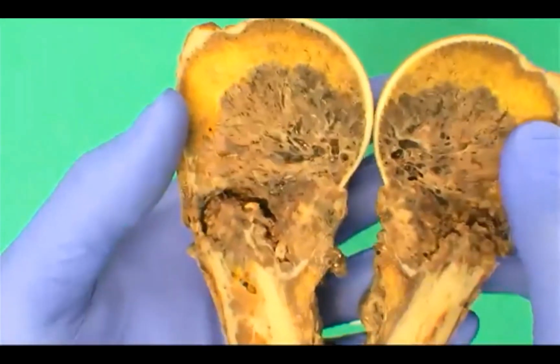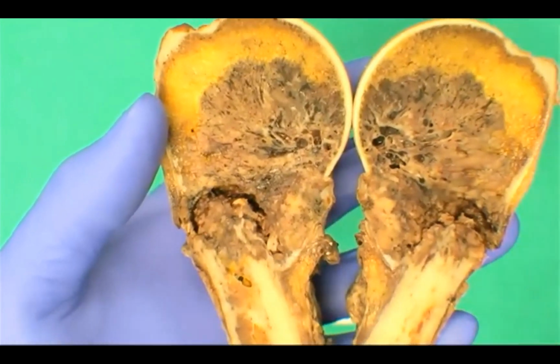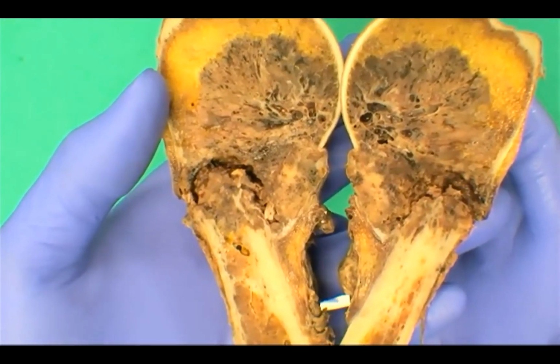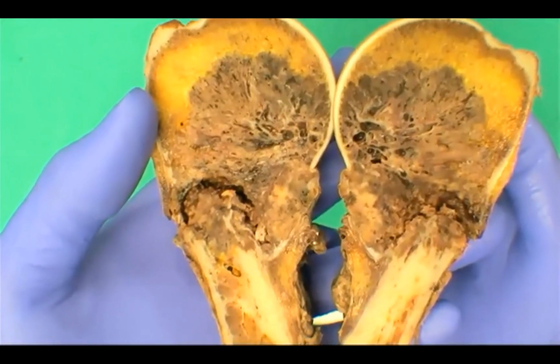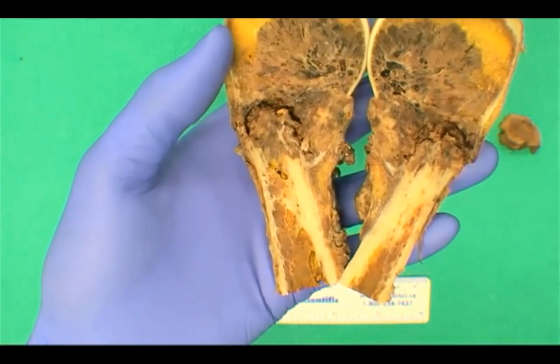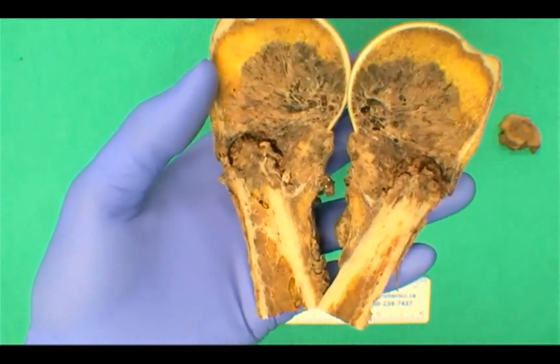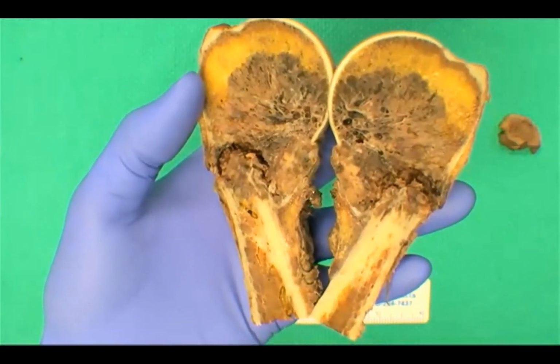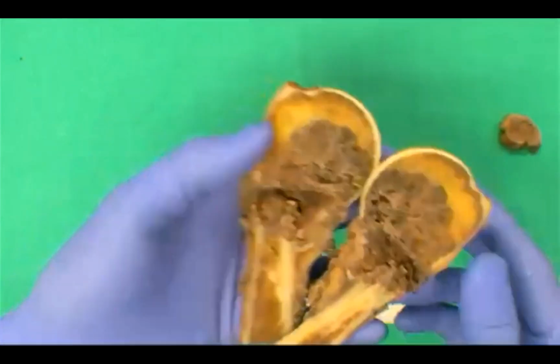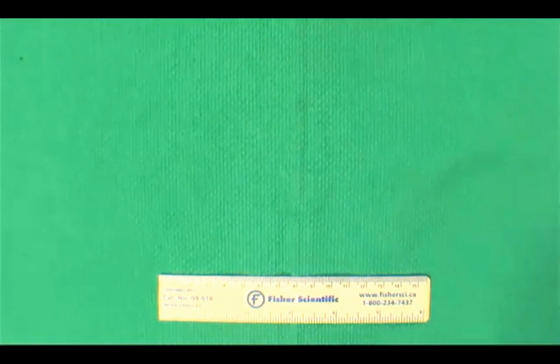Given that this is a pathologic fracture, the sections that we take will be a little bit less than if this were a resection for a bone tumor. By the way, we're not saying that this is sarcoma. I think all we can say is that this is a secondary bone lesion. Okay, we're going to jump to our second specimen now.